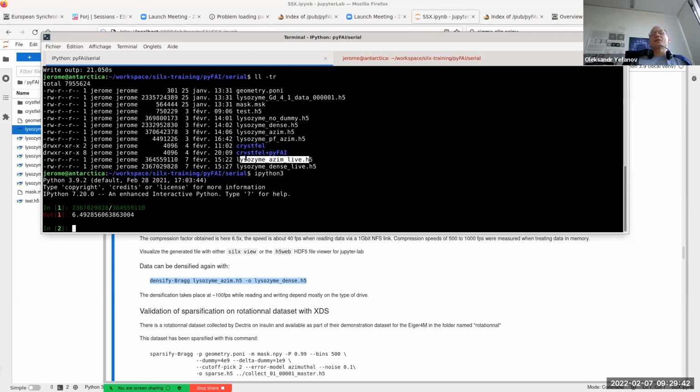Right, but again, everyone is interested in something like single photon counting, basically. Half a photon is not really interesting to users, right? So you can truncate. Well, users will require everything, if you ask them. On one hand, you said that you're interested in the noise, and on the other, you said you don't. Well, I'm a user. I know that if you ask users, they will say you need everything. But there should be some compromises, and a compromise at the level of single photon, I think, is well justified. All our tests show that it's fine to truncate to single photon values at least.